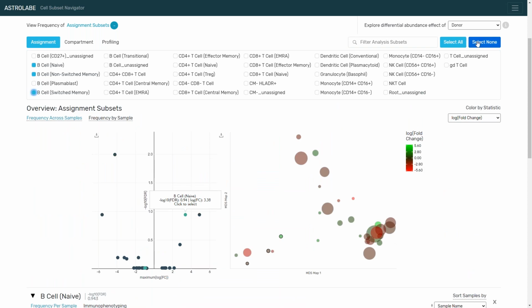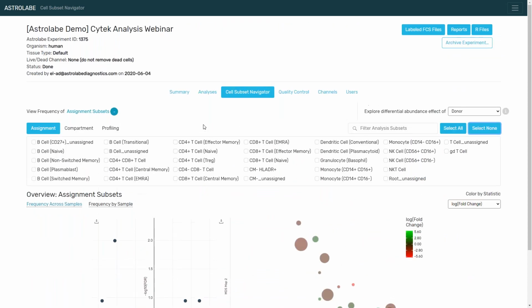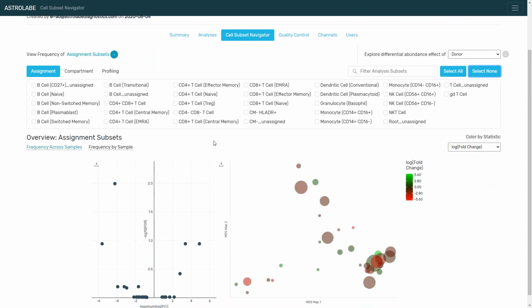So one last thing I want to look at is this idea of unsupervised clustering. If you're going into the Aurora, one of the exciting things about the Aurora is that you can include these additional markers that have biological significance, but are not as straightforward to analyze, like, let's say, CD14 or CD20.